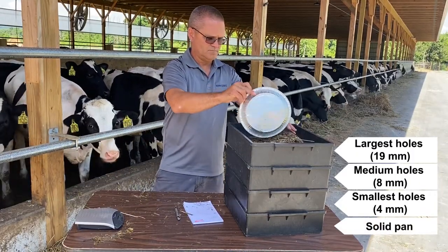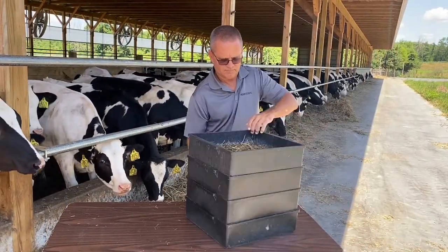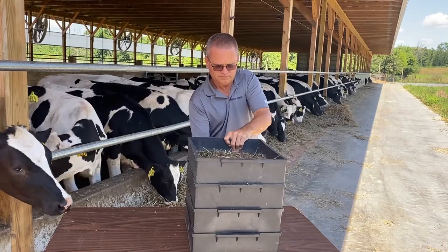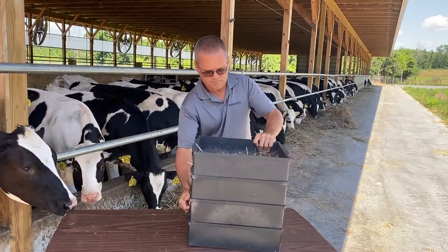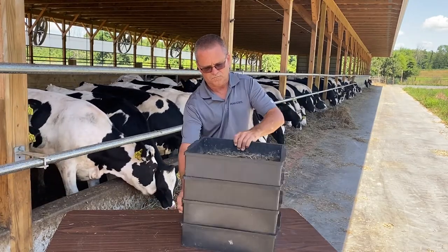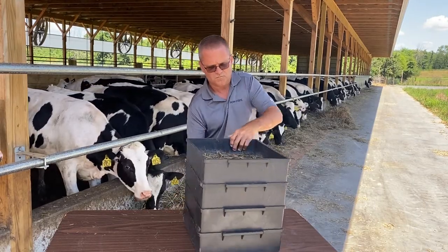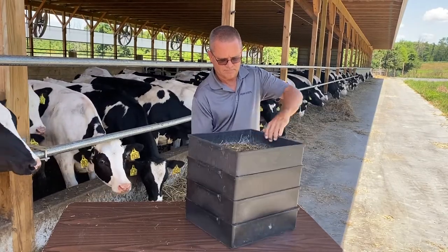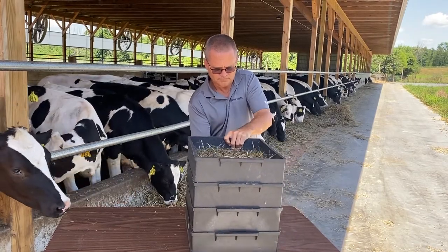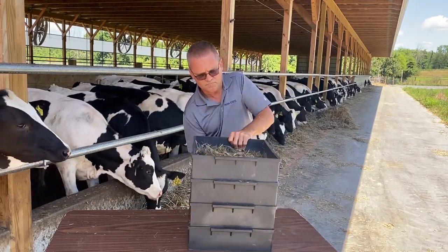Place the collected sample of TMR or forage on the upper screen. On a flat surface, rapidly move the sieves back and forth five times, then rotate the separator box clockwise one quarter turn. Repeat this process three more times. Then begin turning the boxes counterclockwise for four more sets, rotating the separator after each set of five movements. In total, you will have moved the boxes eight sets or 40 rapid movements.